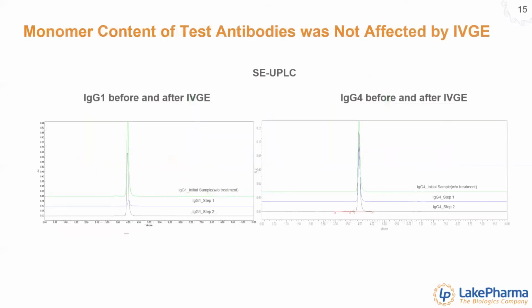The HPLC results of the samples after IVGE are shown on slide number 15, and consistent with our previous results, we do not see changes of aggregation profile before and after IVGE reaction.